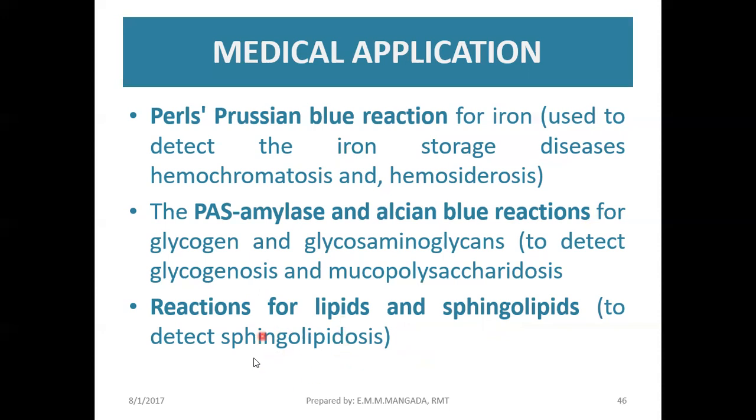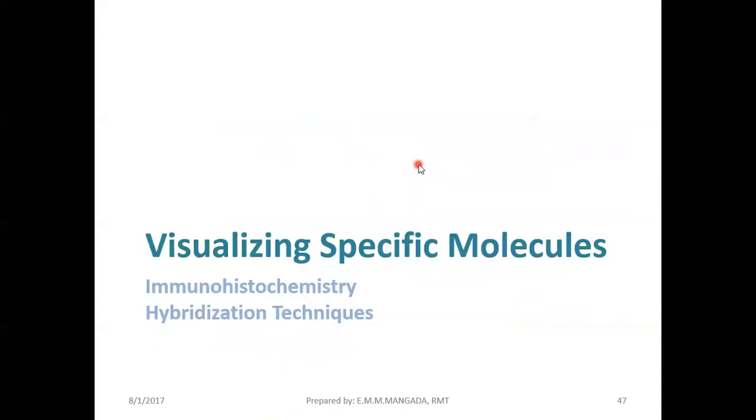That's why this precursor substance is actually stored and is not metabolized. So nagkakaroon tayo ng accumulation nung substance na yon. So we detect that using that method. So that's enzyme histochemistry.